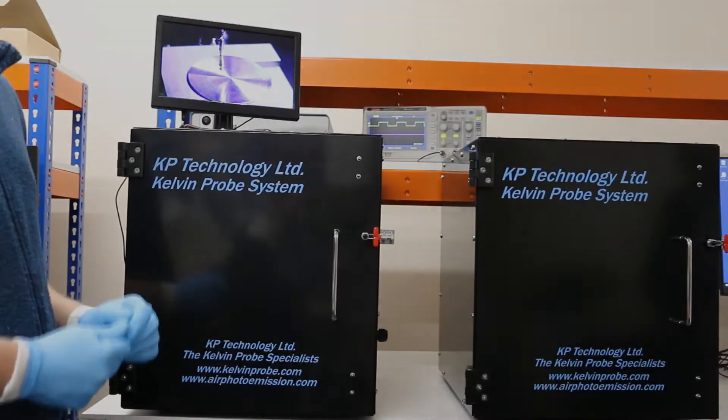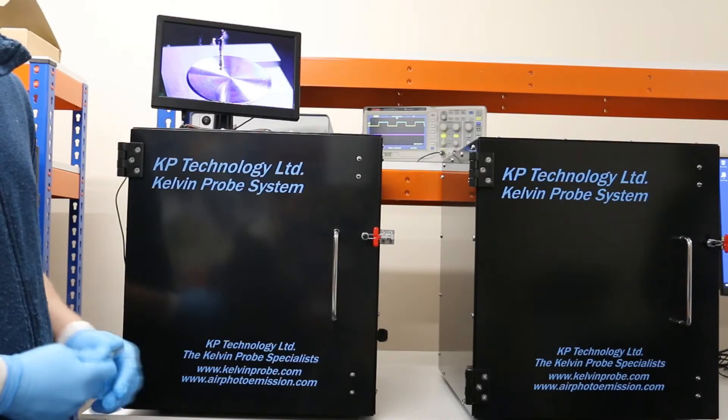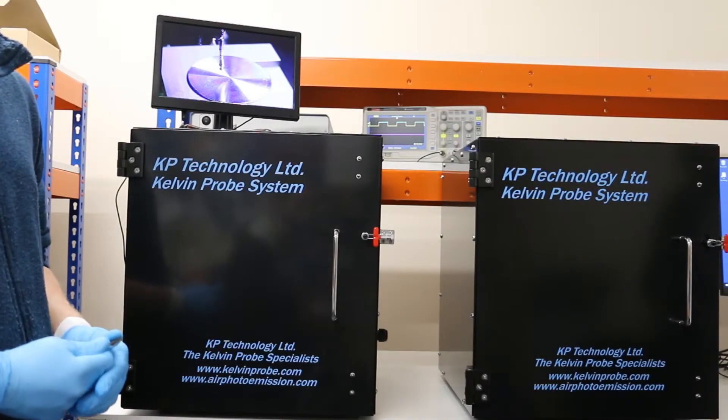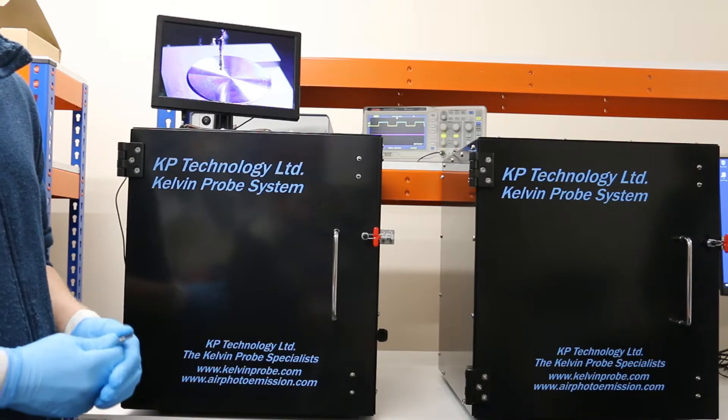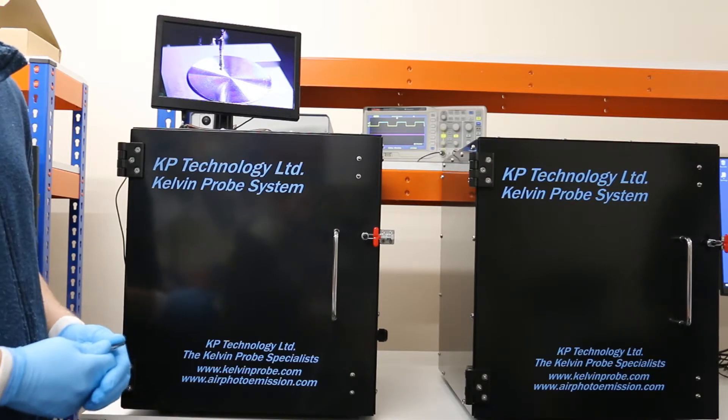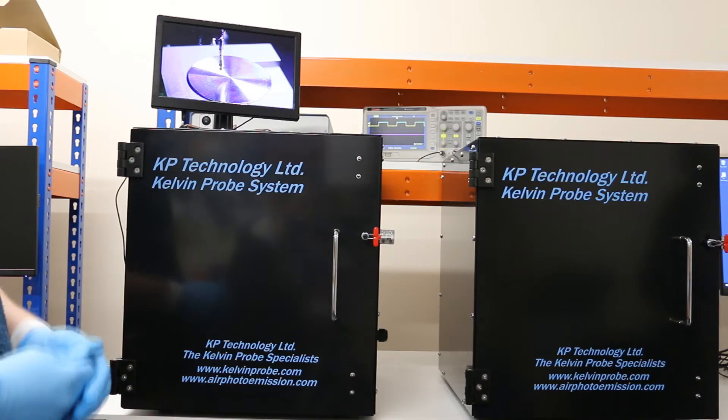This video is going to cover how to use our Kelvin probe to take a single point contact potential difference measurement on an aluminum sample using our KP020 system.